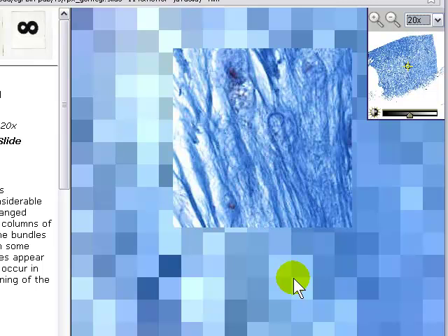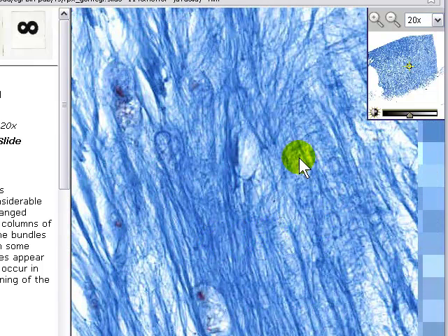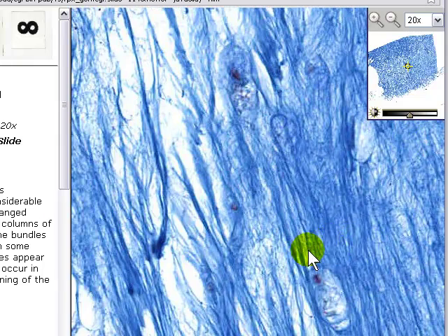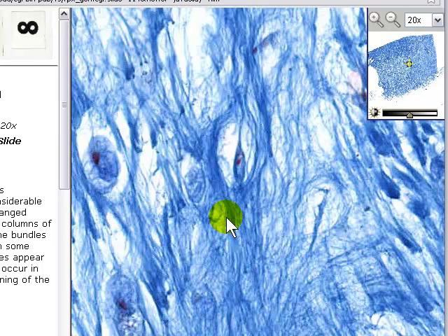Now again, it's not possible to make out or to tell the difference between collagen type 1 and collagen type 2 as you see it in very disorganized fibrocartilage like this. It's enough to say that mainly the fiber component we can see here is collagen type 1, and the collagen type 2 is largely confined to the region immediately surrounding the chondrocytes in their lacunae. And this type of highly disorganized fibrocartilage is fairly characteristic and typical of some special joints called symphysis joints. One with which you might be familiar is the pubic symphysis at the front of your pelvis.